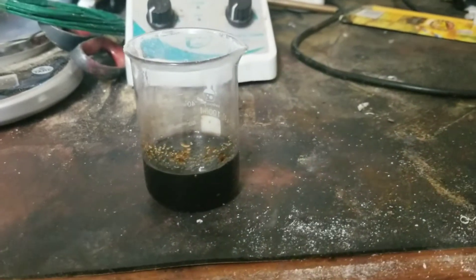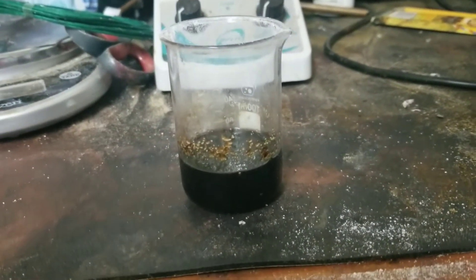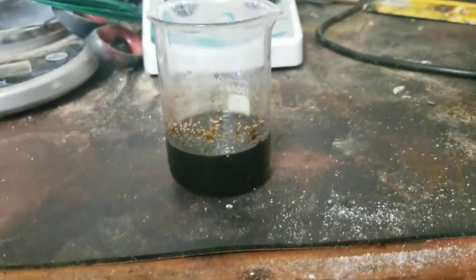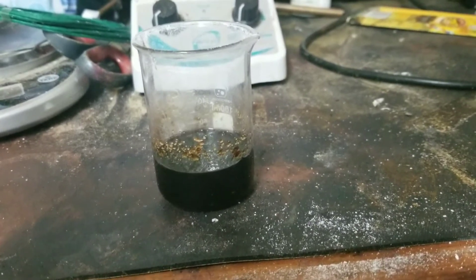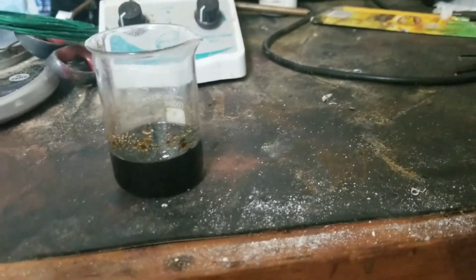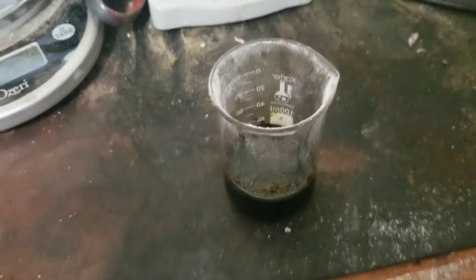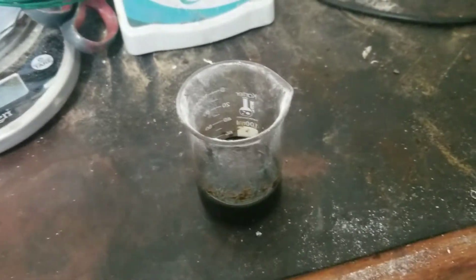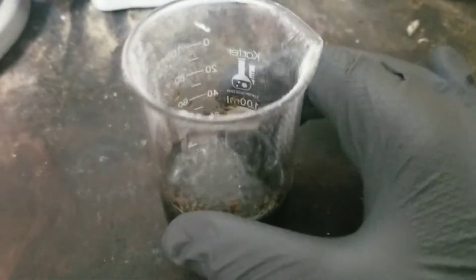Why is that not going? Oh, I think it's about to go. It should go soon. It is black — you can see that it made carbon. Why is it not... it's warm but it's not hot. Why is it not working?